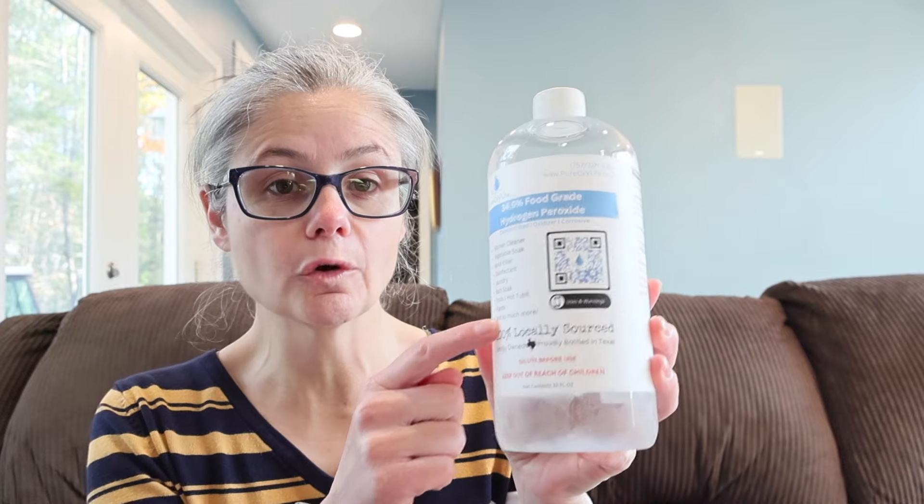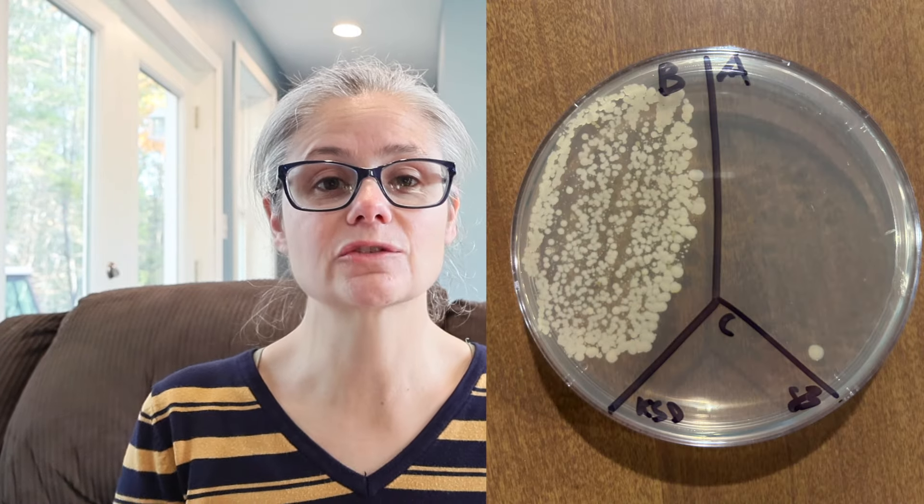Next, let's look at the results for when I took the 34.5% hydrogen peroxide and diluted it myself with distilled water to make a 3% dilution. The kitchen sink: in the before section we can see a lot of bacteria, and in the after section there's no bacterial growth at all — an excellent job. The kitchen sink drain: in the before section we can see a lot of bacteria, and in the after section we can see one bacterial colony — still an excellent job removing bacteria from the kitchen sink drain.